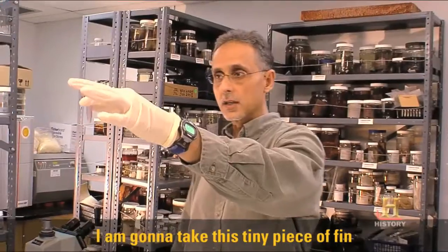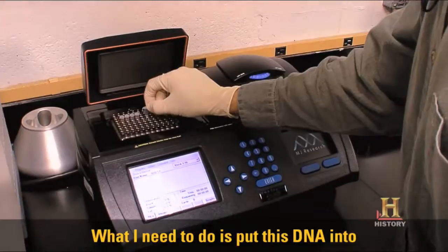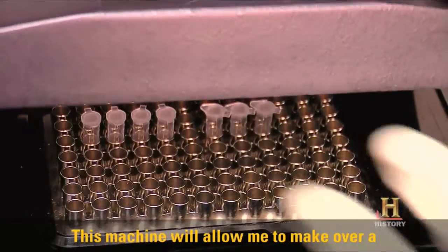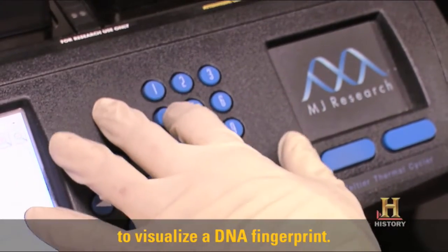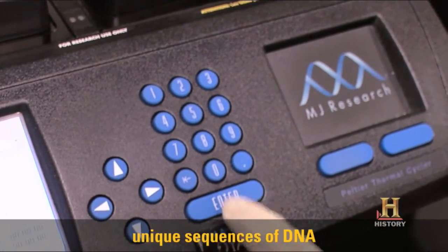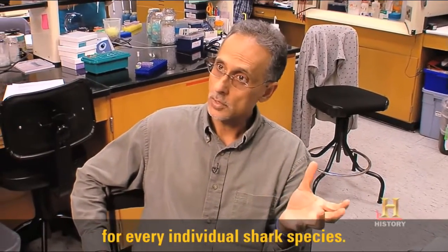I'm going to take this tiny piece of fin and extract its DNA. What I need to do is put this DNA into this machine here — it's called a thermal cycler. This machine will allow me to make over a million copies of the DNA, which will then make it easy for me to visualize a DNA fingerprint. The DNA fingerprint simply represents unique sequences of DNA for every individual shark species.